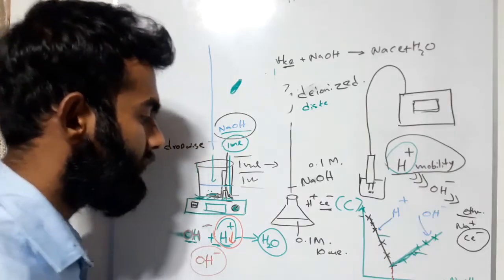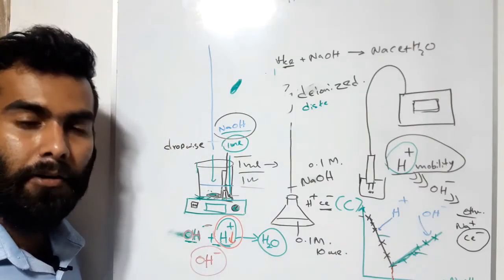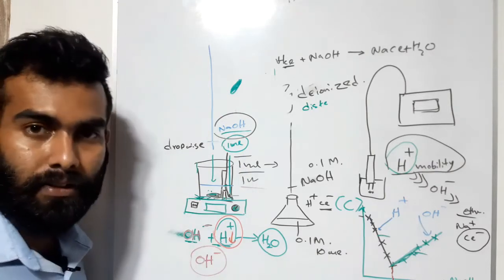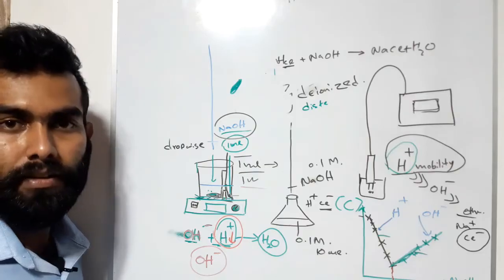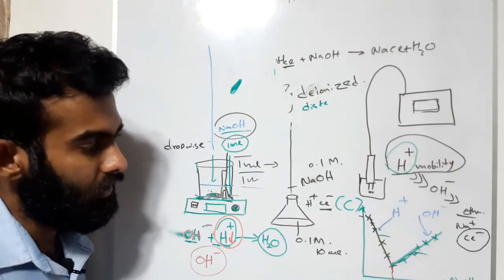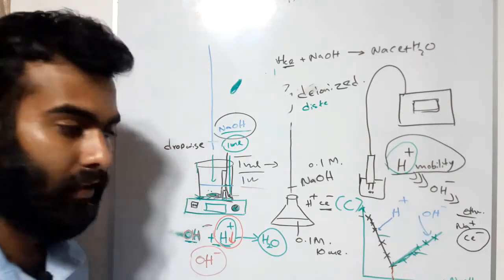However, in conductometry, when we are using conductometric data for titration, that is more accurate than the sophisticated titration methods which are using indicators. We can read the endpoint likewise.